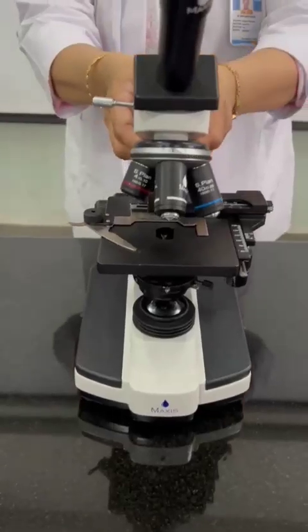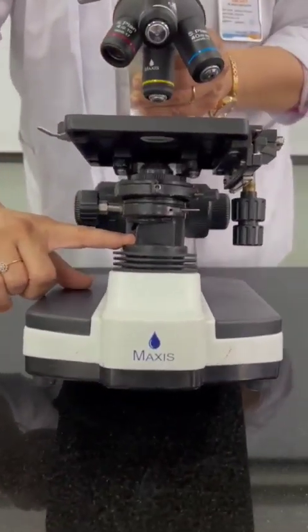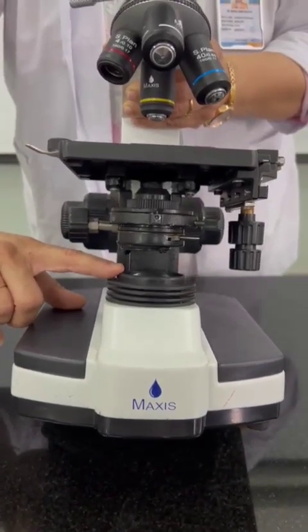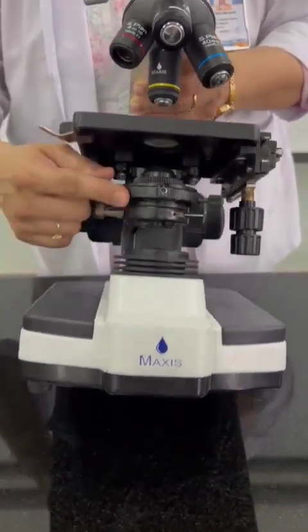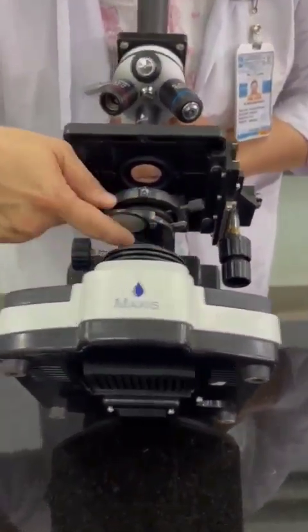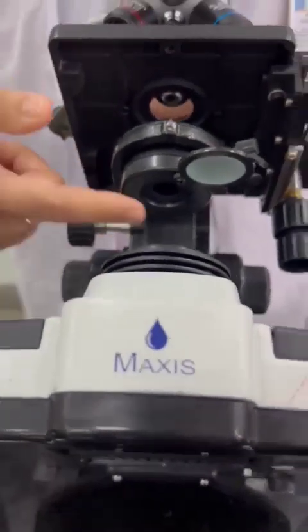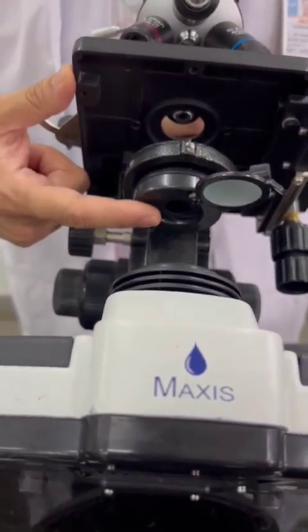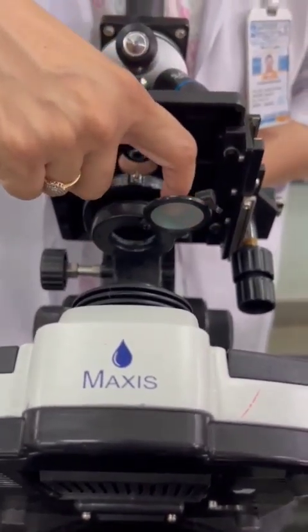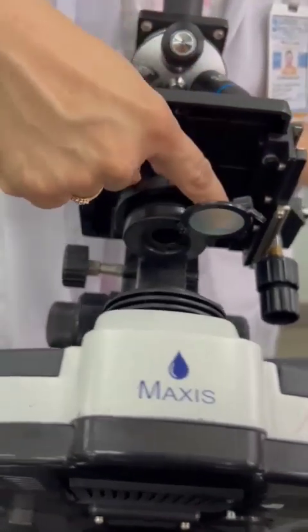Now in substage parts, as we can see here, this is the illumination. For illumination, we have an inbuilt source of light. This light will fall on the condenser. Now in this condenser, if we appreciate it here, you can see an aperture. This is the iris diaphragm. This iris diaphragm is responsible for controlling the amount of light that enters the microscope.